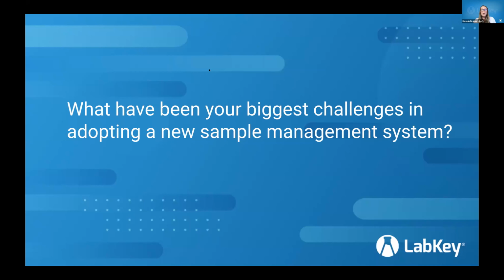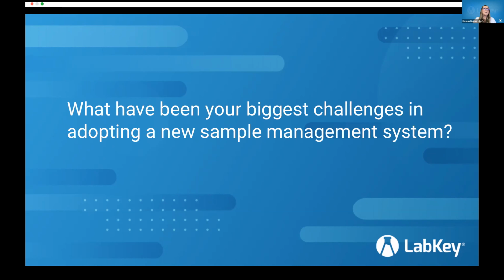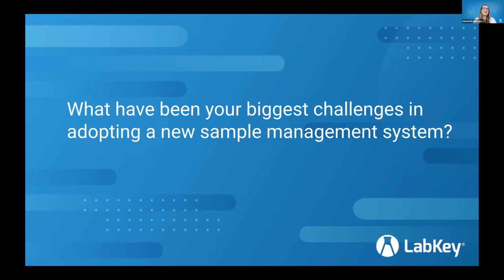So I've got one more poll for you today. I'm very interested in hearing what your biggest challenges have been in adopting a new sample management system, or what you might perceive your biggest challenges to be in that adoption as well. I'll give you a couple seconds here, and I'm just going to look at the Q&A while people are answering.